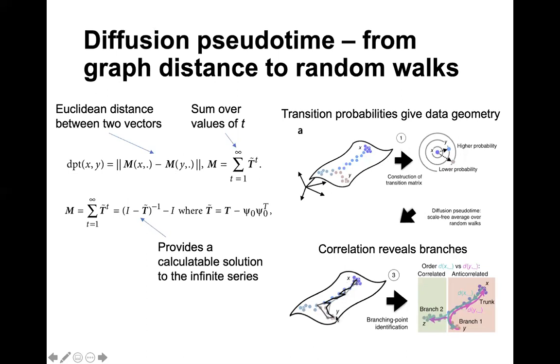Paths from X to Y and Y to X, and then from Z to X has an inverse relationship, that as you're going on this branch from X to Y, the diffusion distances are getting smaller, but actually the distances to Z are getting larger. And this might be a little bit confusing right now.